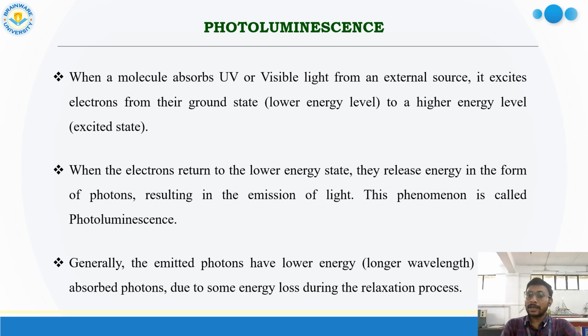If they emit energy in terms of light, then we call it photoluminescence. And that is what our fluorescence spectroscopy is all about. That is photoluminescence, which is an emission spectroscopy.